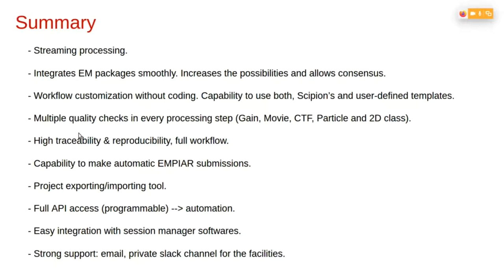We are monitoring the effective gain stability, also the movie drift and the CTF parameters, and so on. As Scipion is working in workflows, and all the parameters that are set in those workflows are still stored there, we provide high traceability and high reproducibility of the Scipion projects.